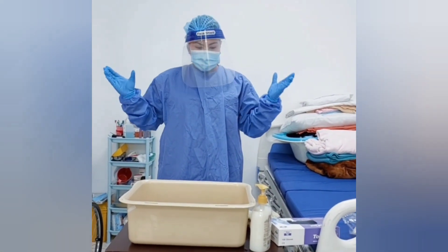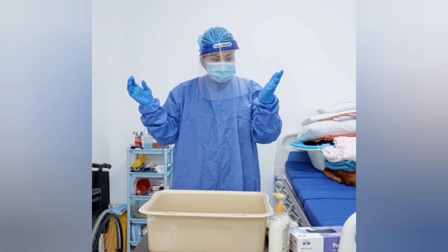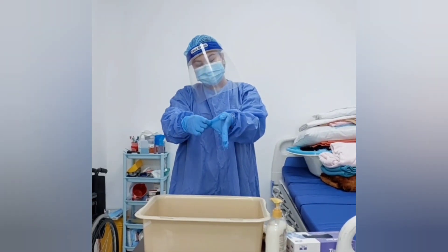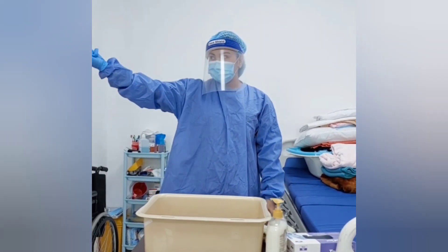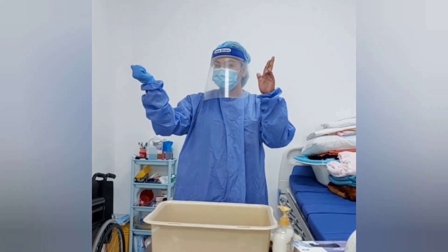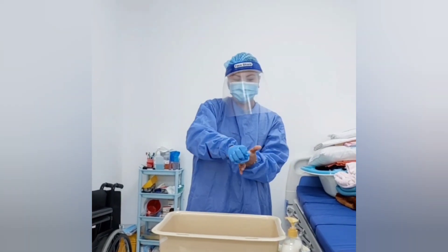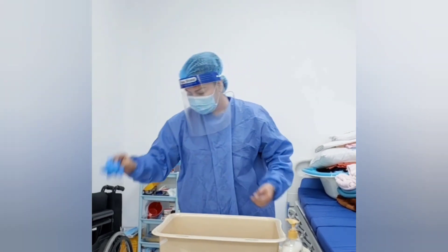Now I will be removing or doffing the PPE. First, I will remove the glove. Pinch here and stretch. Peel to remove and hold the glove back. Use the bare hand or two fingers to remove the second glove inside. Be careful not to touch the contaminated area. Direct to the bin.